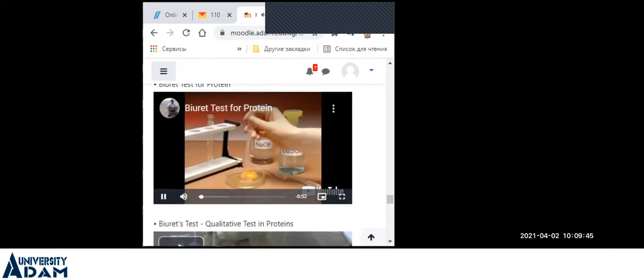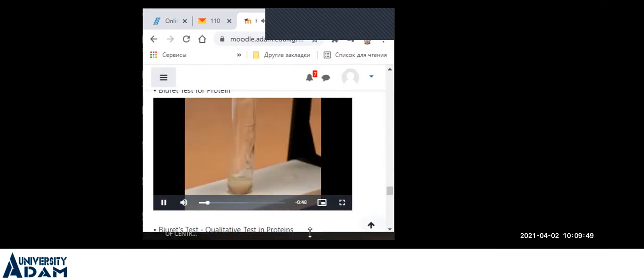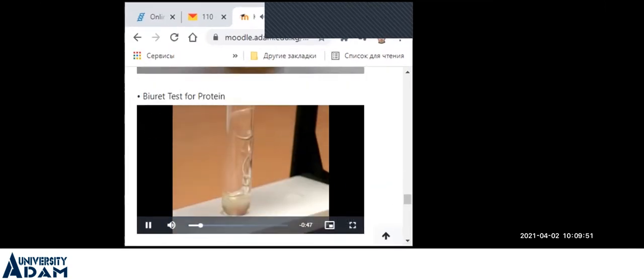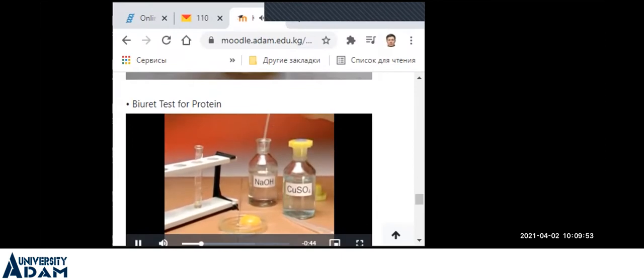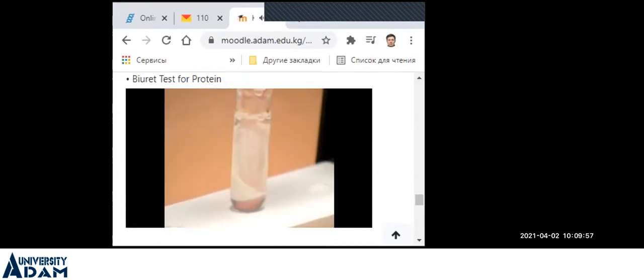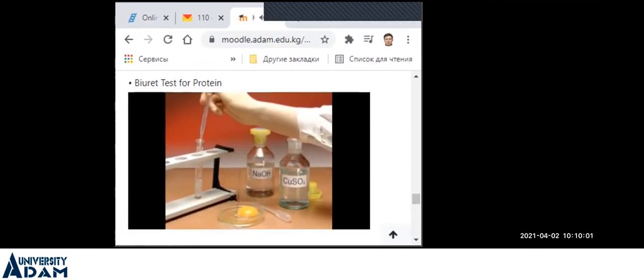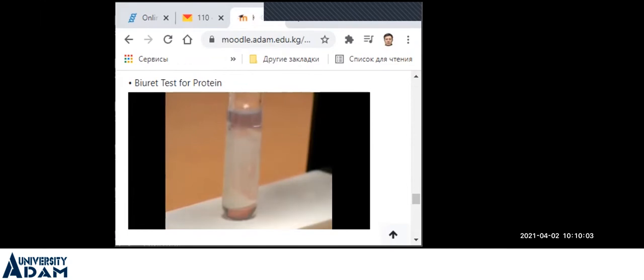Egg white contains a lot of protein. The test for protein is called the Biuret test. This involves adding some sodium hydroxide solution, then running some very dilute copper sulfate solution down the side of the tube. At the top of the mixture, the colour change to mauve shows that protein is present.